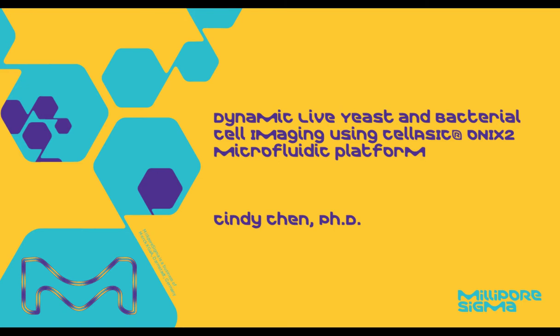I'm a scientist in an R&D group that has been designing, creating, and launching various microfluidic cell culture devices and plates for live cell imaging. Today, we're going to talk about the CellASIC ONIX2 Microfluidic platform and how we use it to capture real-time, high-quality images on growing yeast and bacterial colonies during the experiments.